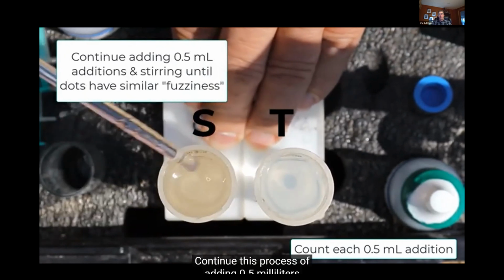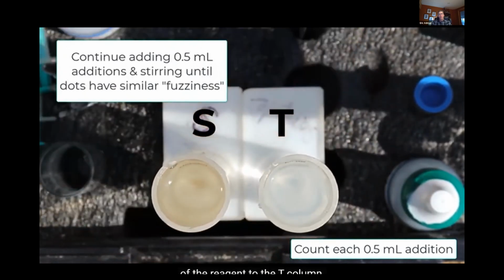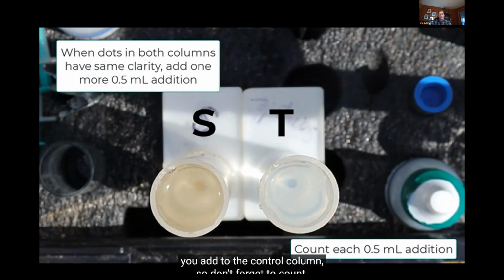Continue this process of adding 0.5 milliliters of the reagent to the T column until the dots in both columns appear to have the same fuzziness or clarity. You will need to know how many additions you add to the control column, so don't forget to count.